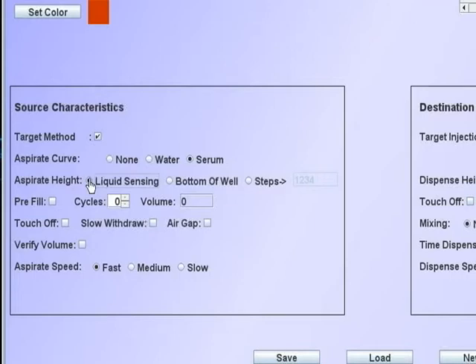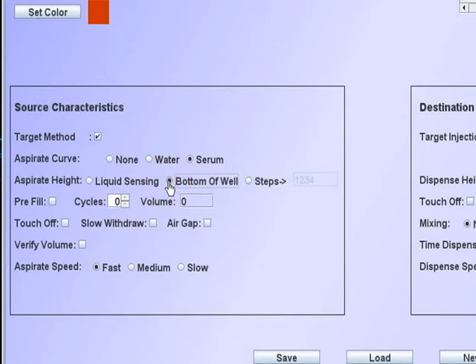Liquid level sensing should not be used when aspirating from a microplate well. It will not be effective. Checking the bottom of the well will aspirate from the bottom of the well as defined by the plate database. That specific plate must be defined on the deck layout for that position.